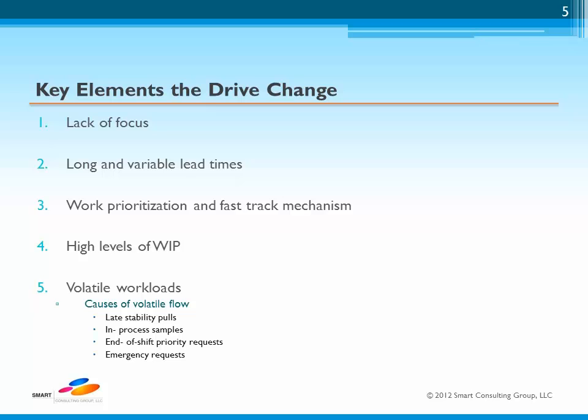Short-term prioritization of samples where no known ground rules exist often causes inefficiency in the overall functionality, because the systems are always abused and sooner or later every sample is a priority number, which means nothing is a priority and a state of chaos results. Again, the various levels of waste increase and the intent of the program results in the opposite result.